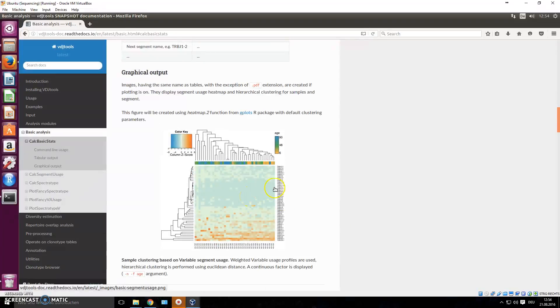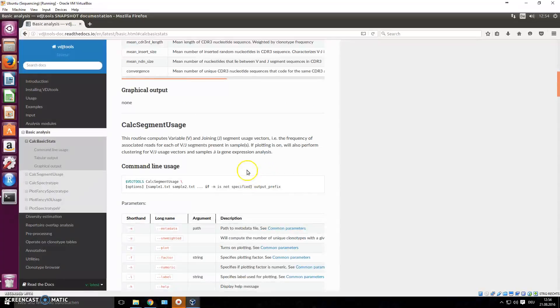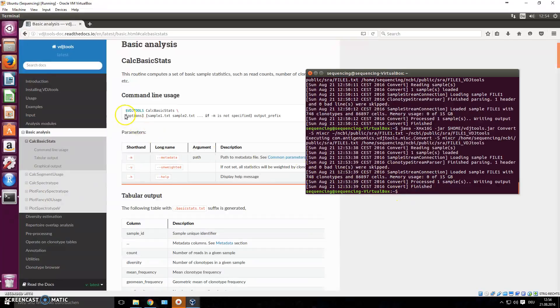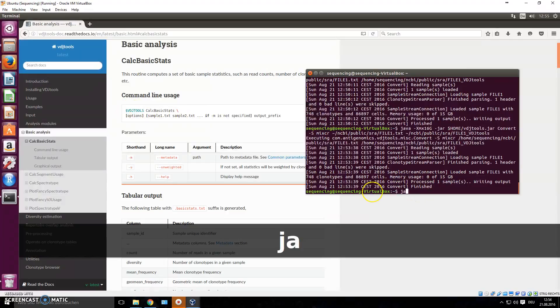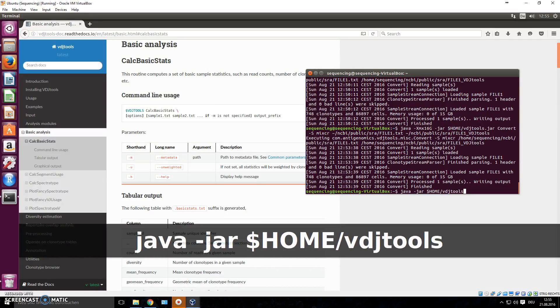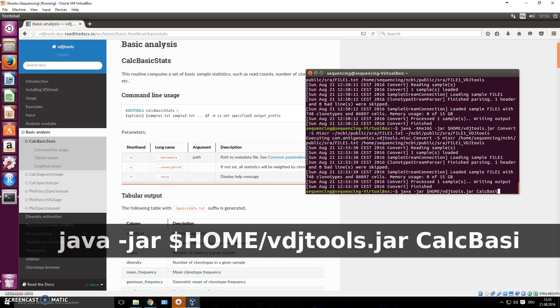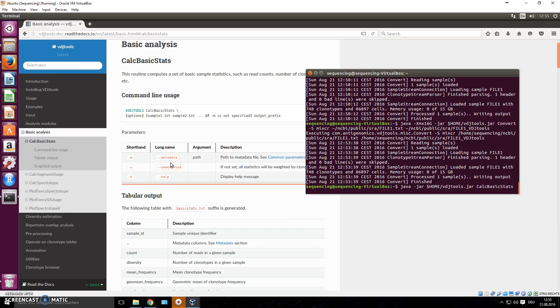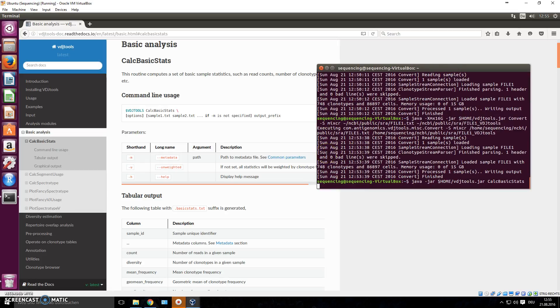This does give graphical output apparently — you can choose to get clustering based on variable segment usage, which we've already seen in our TCR videos. Our samples aren't very diverse so the graph won't look too diverse, but we'll look at it anyway. To use 'calc_basic_stats', we type 'java -jar vdj_tools.jar calc_basic_stats'. You can provide metadata if you want calculations for several files at once — useful if you have a whole folder of files.